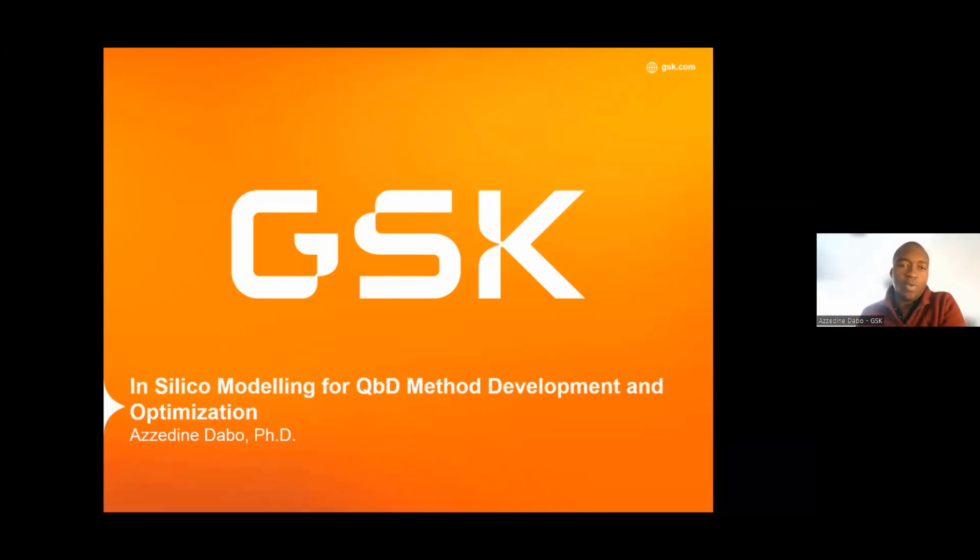Today I'm going to talk about how we can use in silico modeling for quality by design, method development, and optimization. What I'm going to be talking through today is a project where I've used modeling software. I'll be showing you how I went through the whole process to optimize the method and make it more efficient in GSK.